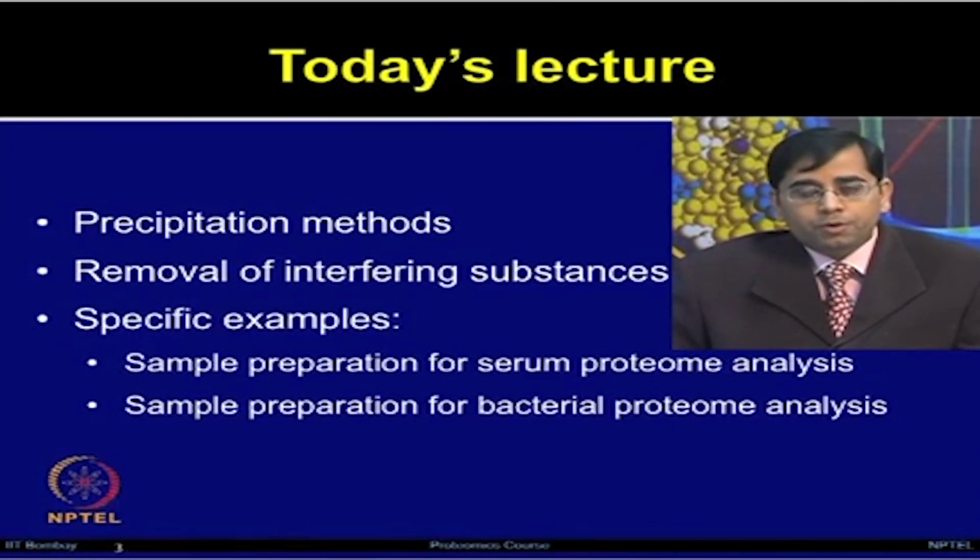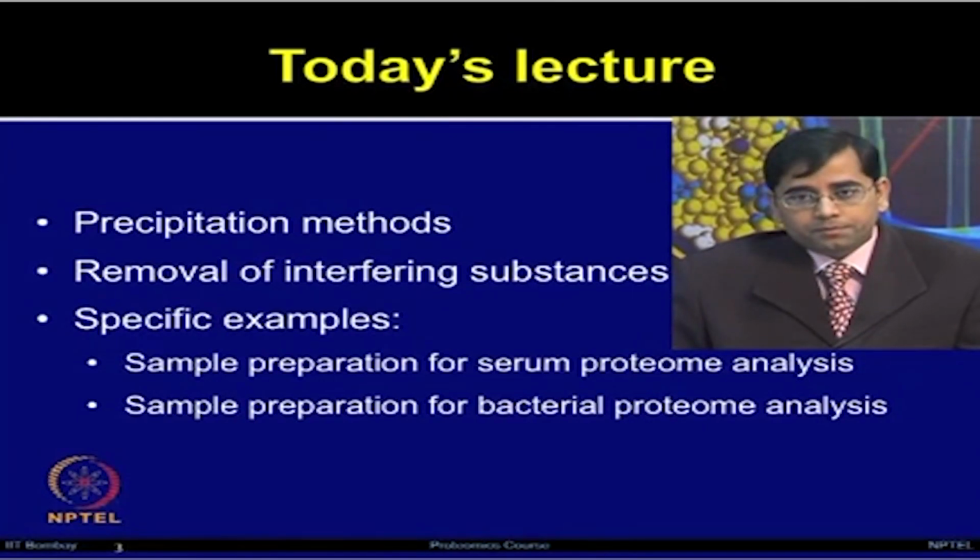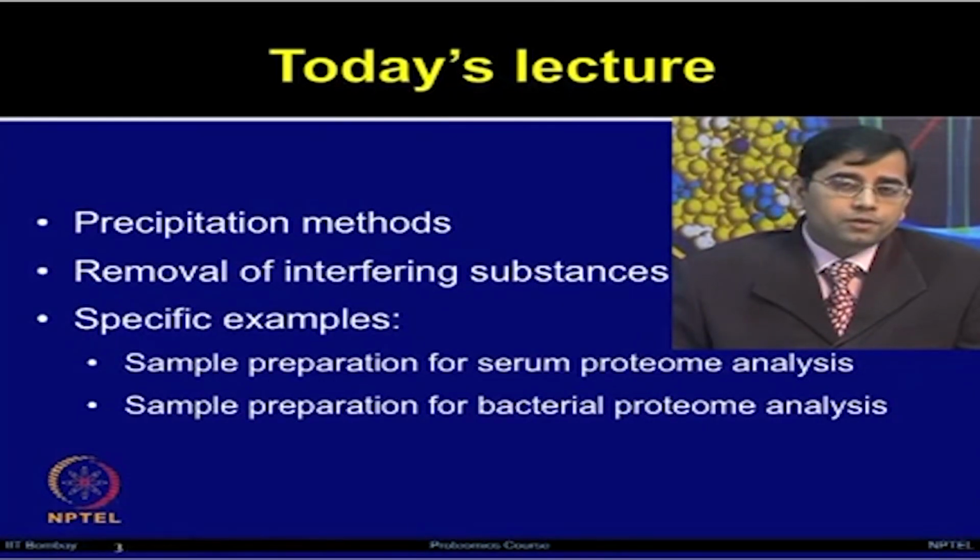So, I will talk to you about some of the commonly interfering compounds and how one can try to get rid of them. Then we will move on to specific examples, the sample preparation for the serum proteome analysis and sample preparation for bacterial proteome analysis.